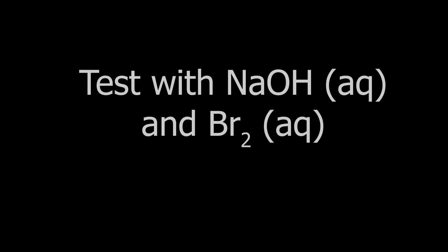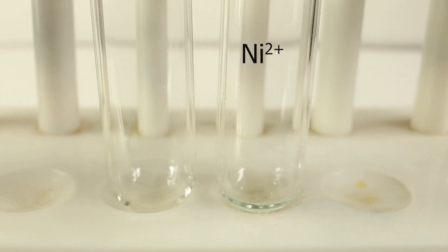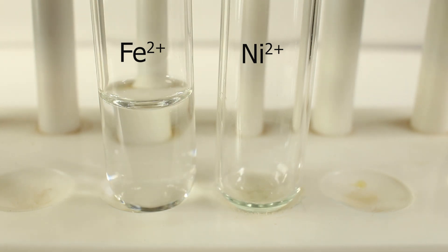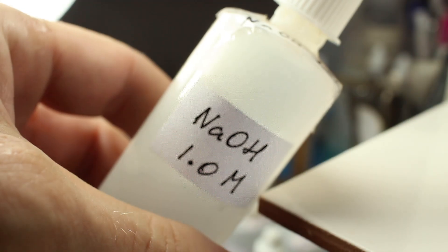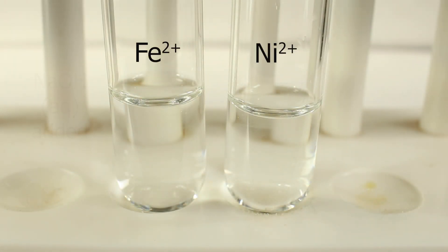What can be done with nickel-2-hydroxide? If you oxidize it with bromine, it would give a very characteristic black precipitate. Let's look at this test now. Again, I take the same pair of substances — iron-2-sulfate and nickel-2-sulfate. I really need very low concentrations, so I've added distilled water.